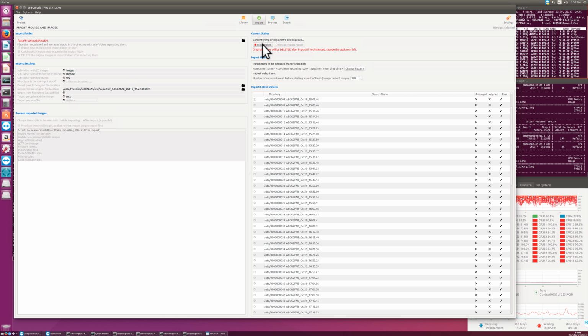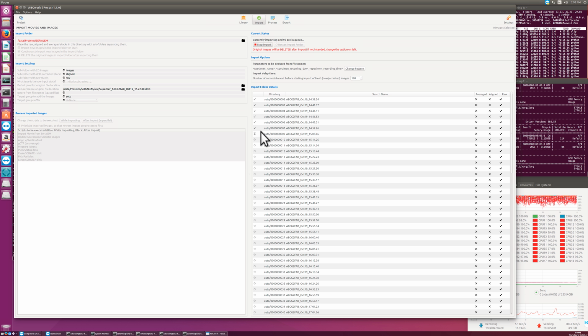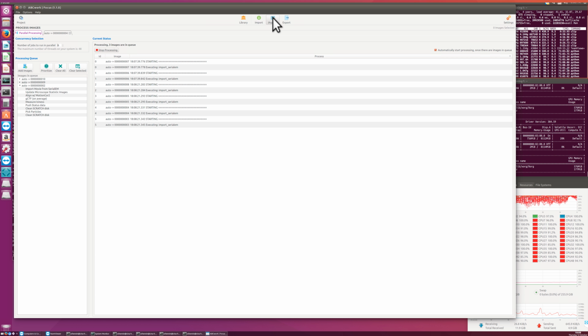And then Focus would sit there and check the file on your K2 computer, and whenever SerialEM or EPU has recorded a new file, it would copy it over, delete it over there, fill it with these scripts into the batch queue, and the batch queue will fill up, and six of them will always run. So the newest imported one will always go to the top because we said so, and 6 of them will always run, and when one of them is finished, it will pick the next one from the batch queue. You can also clean the batch queue here and move one to the top of the batch queue, and so on.